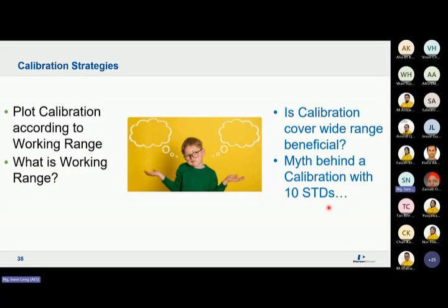Should I focus on plotting the calibration curve where the result is always low? Or I plot a calibration curve for something that, once in a blue moon, I get one sample that is high? Why not do a dilution for the one high sample? You want all the 1,000 samples to compromise for your one-in-a-blue-moon high result?